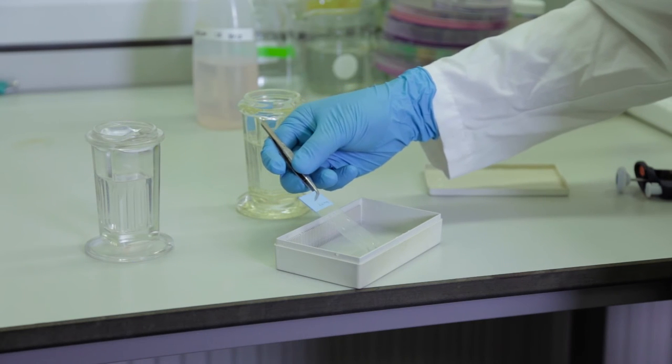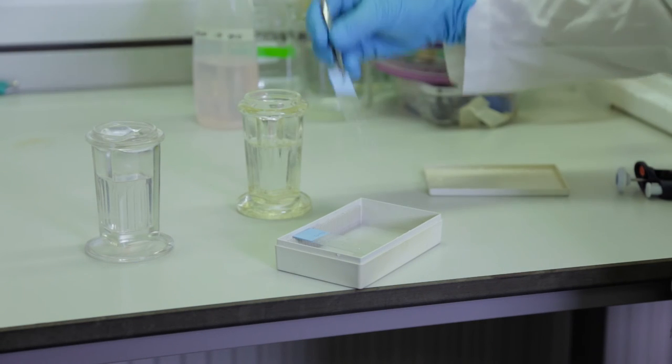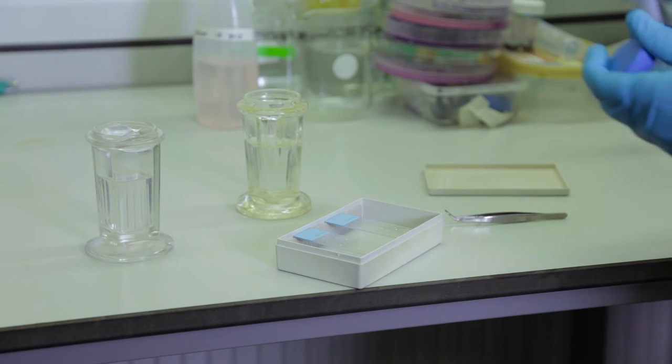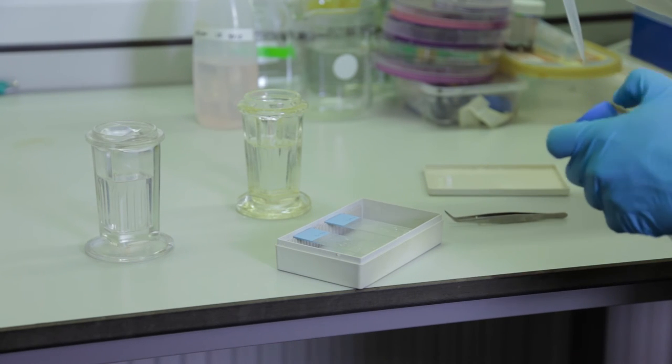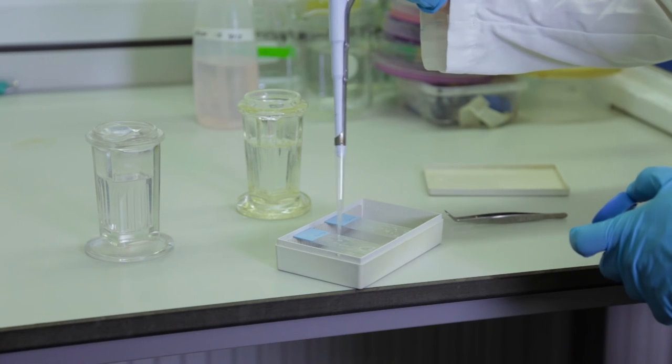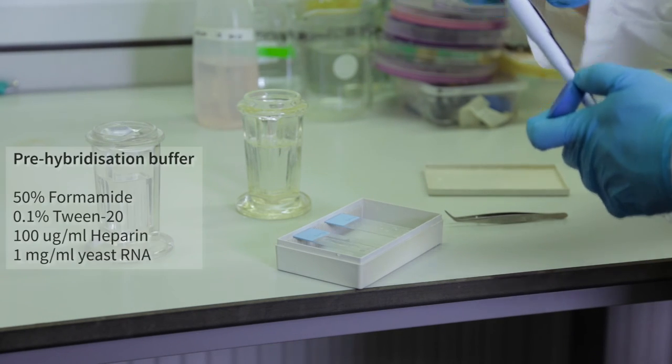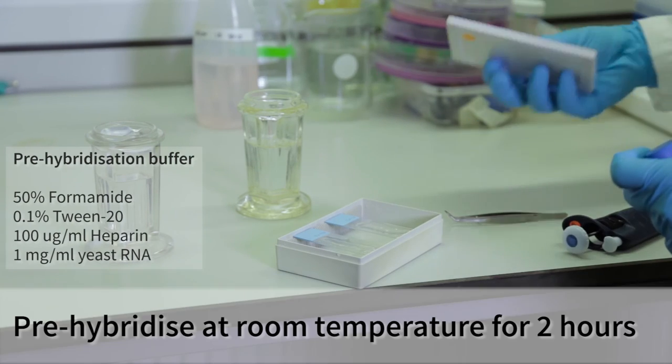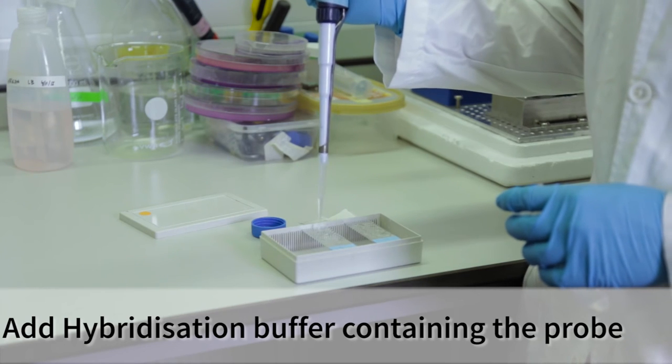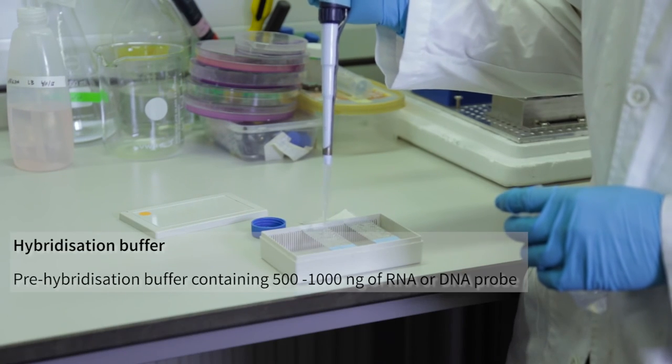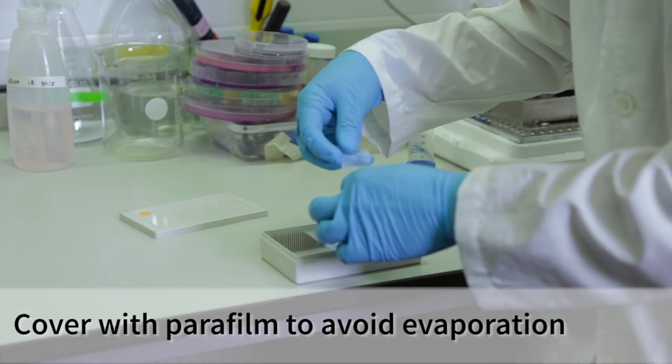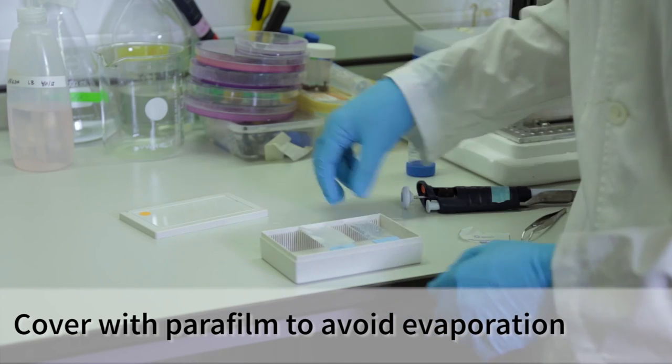We will remove paraformaldehyde by washes. I need to block the slides from non-specific binding of RNA. Pre-hybridization buffer has many different components to keep the RNA denatured, so that it's linear and can bind to the probe effectively. It also has other components that minimize non-specific binding. For this, we will use pre-hybridization buffer which contains yeast RNA. We add the hybridization buffer containing 500 to 1000 nanograms of our probe. Then, we will cover it with parafilm. This is to avoid evaporation of the probe.